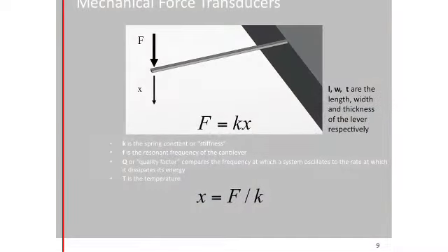Okay. All right. So how does this technique work? Well, the fundamental tool that we use in this technique is our force detector, or our force transducer. And a force transducer is really quite a very simple object. It's, let's say, a cantilever, some kind of a diving board like this, on which you can apply some force, and it will deflect by some proportional displacement x.